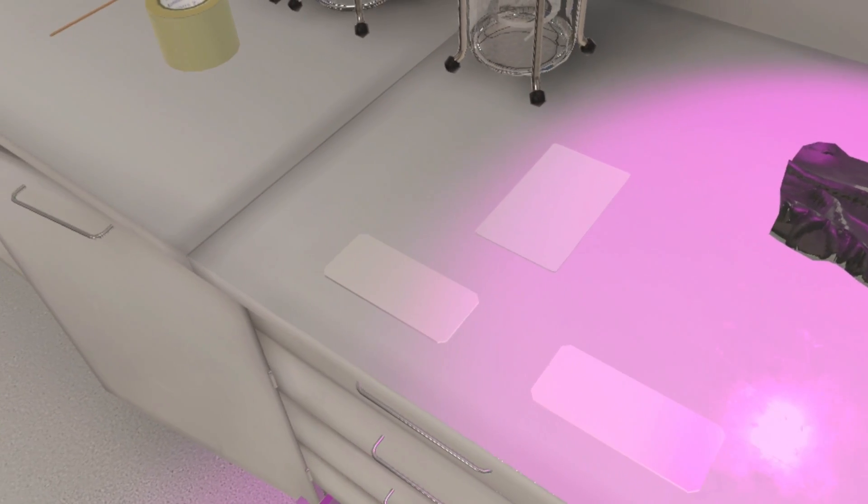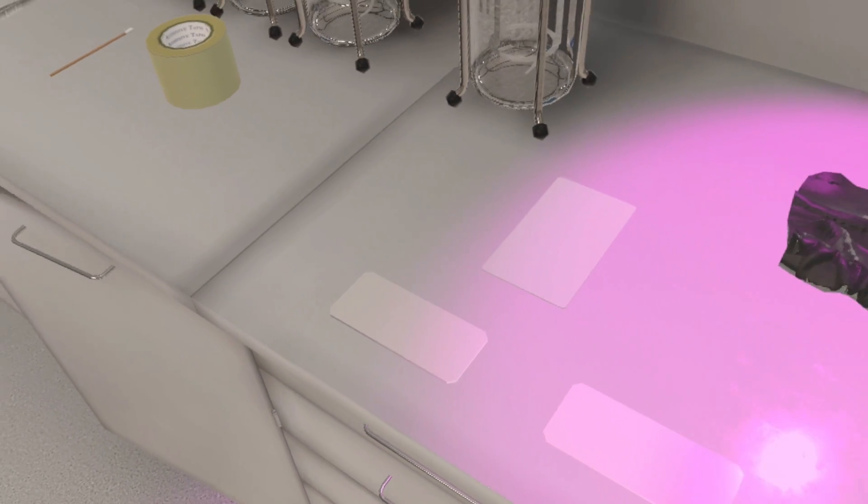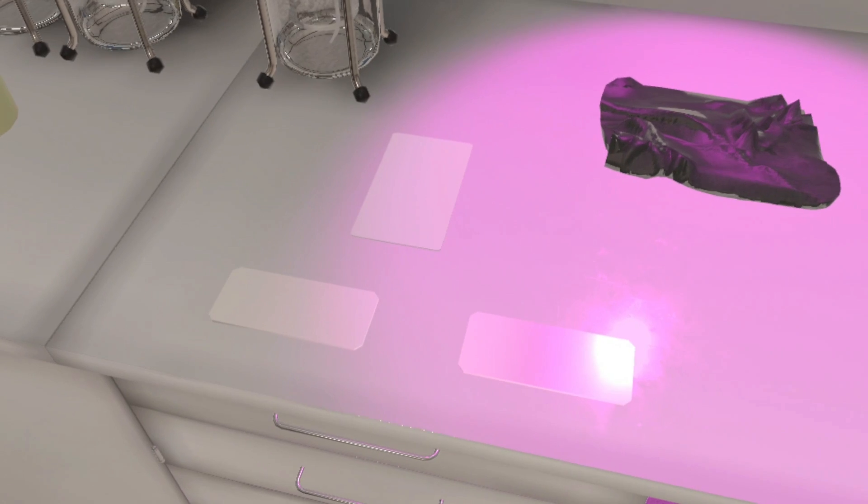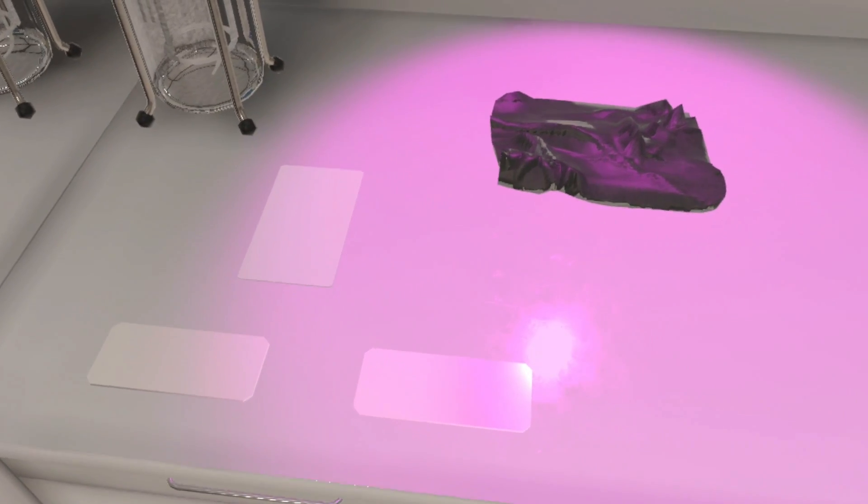Here lies the proof that could belong to the culprit or culprits. Hold and apply the adhesive tape to lift any fibers or hair if they are present. Any fibers or hair found will be analyzed for DNA sampling.